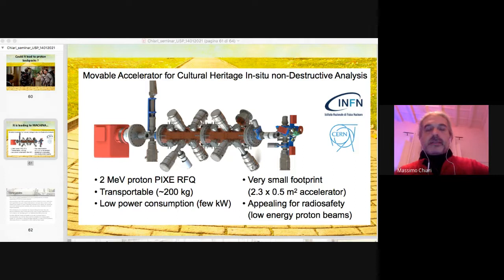The idea is, for example, to change the radio frequency source from proton to helium to have a compact helium RBS system with 2 MeV helium and a small scattering chamber. So to have a dedicated small accelerator for material science with helium. That could be another possibility.